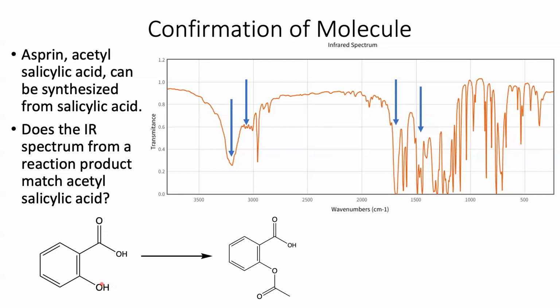So instead of putting a carbon chain on the alcohol, I put it on the acid instead. And so what you're actually seeing here is the spectra for methyl salicylate. So instead of making aspirin, I made oil of wintergreen. So that nice, wonderful fragrance that we associate with the winter season.